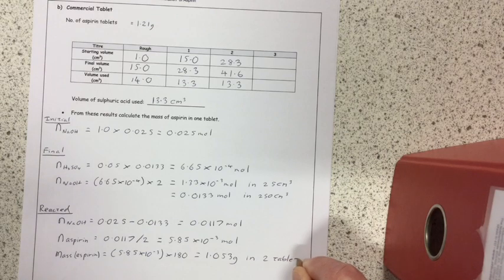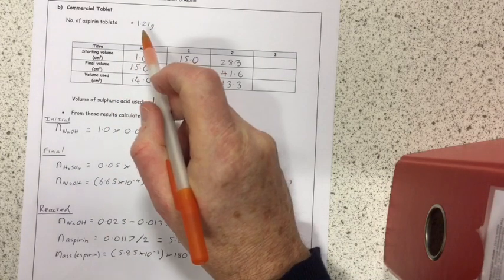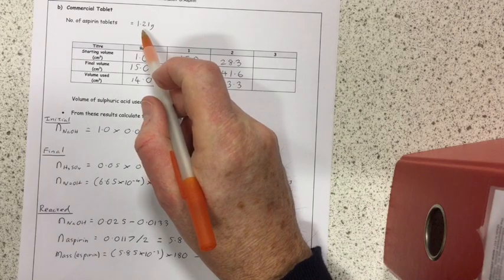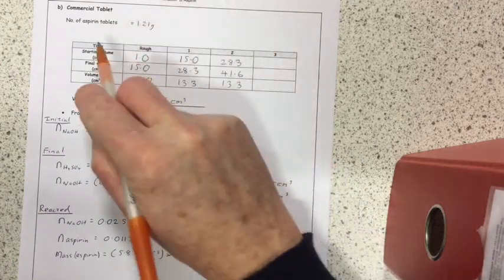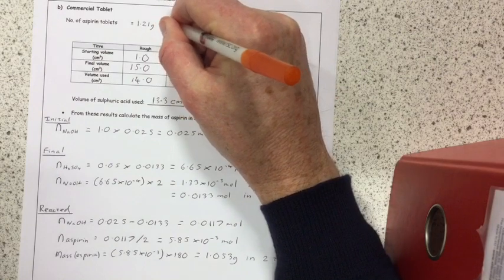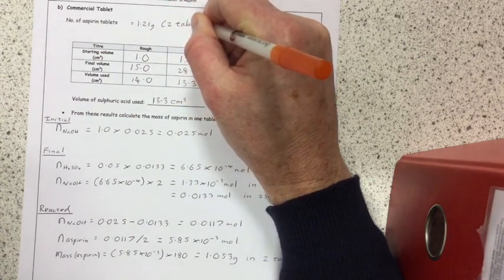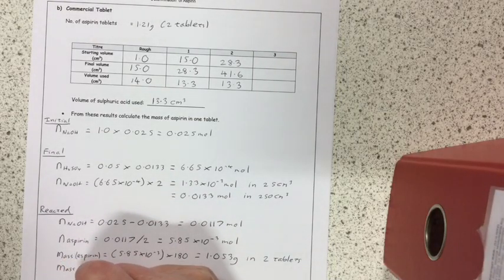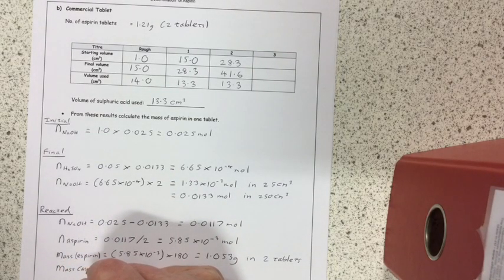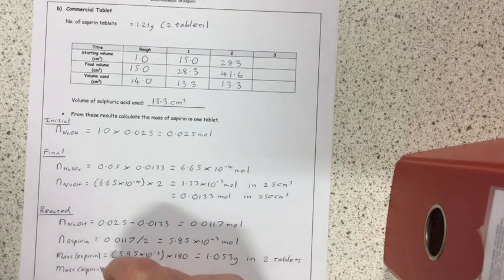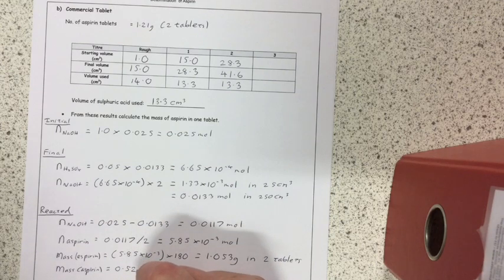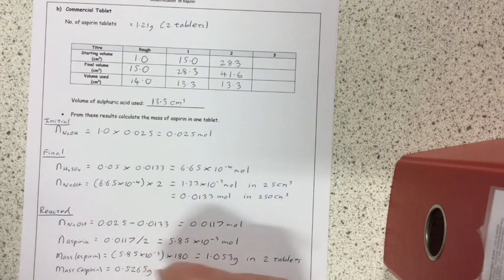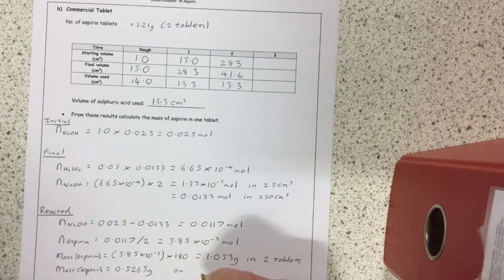Which reminds me, up here I'd put the mass of aspirin, but in fact, what we were supposed to put up here was the number of aspirin tablets, so maybe I should just put in brackets, two tablets. So, the mass of aspirin in one tablet is just that number divided by 2, which is 0.5265 grams, or 527 milligrams.